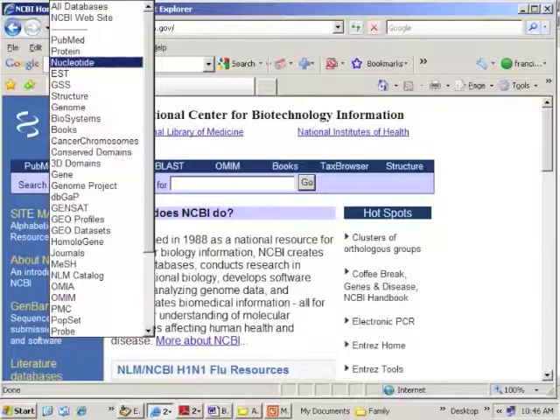And so what I'm demonstrating in this particular page, what I'm emphasizing is that first of all, we can select the database that we're going to search, right? So we can search either the nucleotide database, EST database, GSS, etc. Okay, so the information that you start with is going to be important for what you get out.